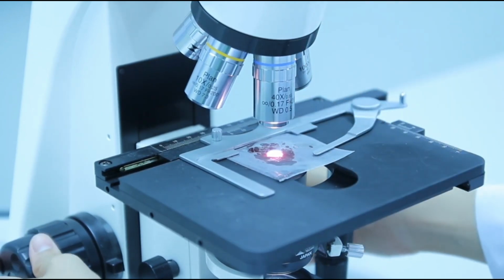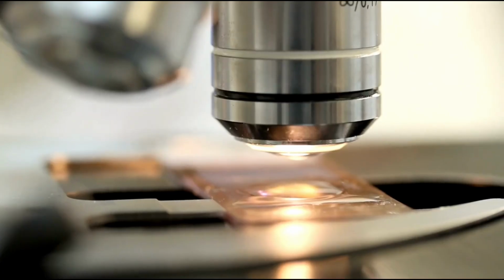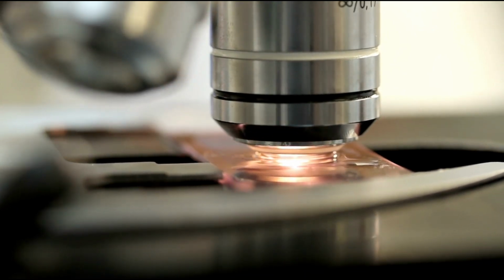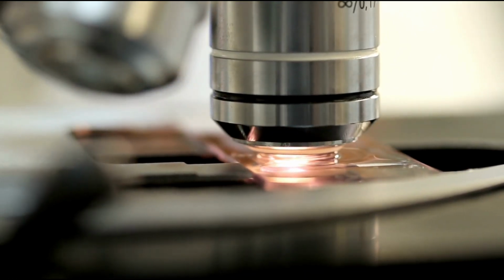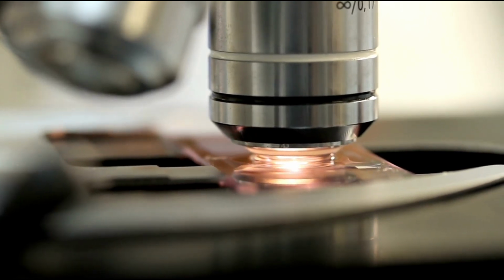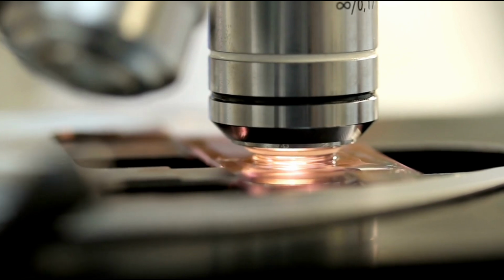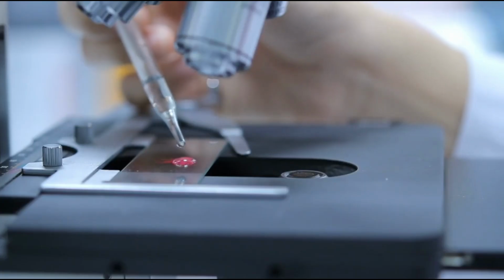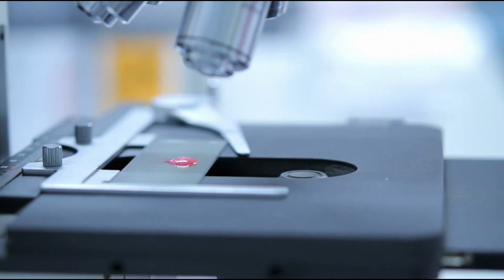The primary lens, known as the objective lens, works closely with ocular lenses to enhance the viewing experience. Together, they can magnify an object many times over, unveiling the complex worlds of cells, bacteria, and fine minerals. Imagine zooming into the velvet of a leaf, where you discover the minuscule cells, each with its own distinct shape and size, working harmoniously to sustain life.